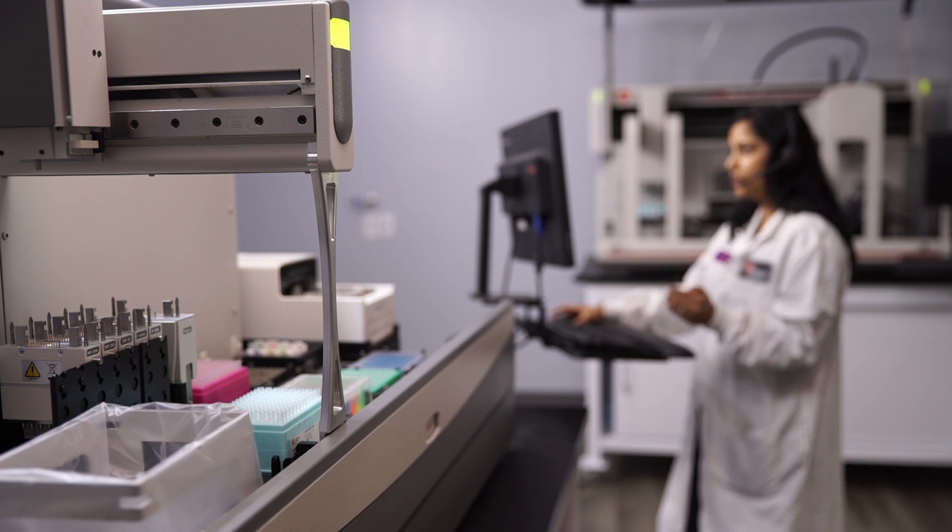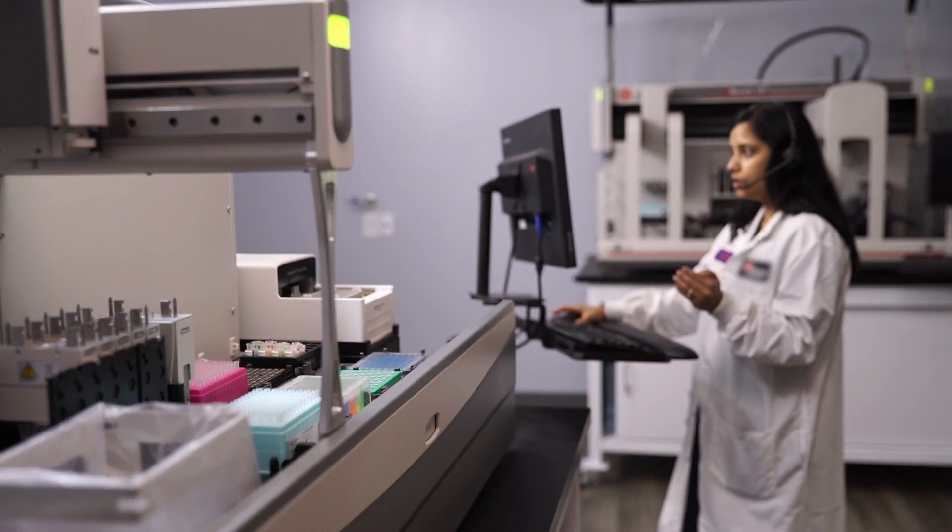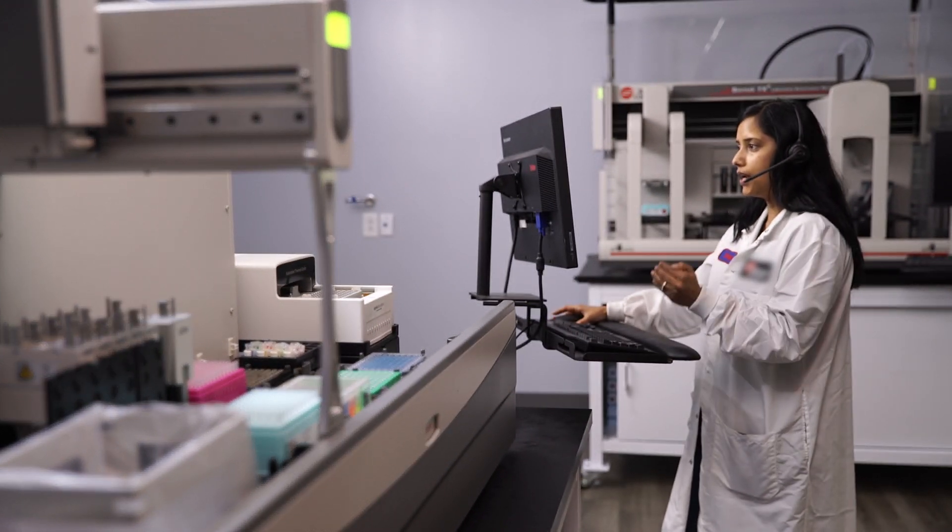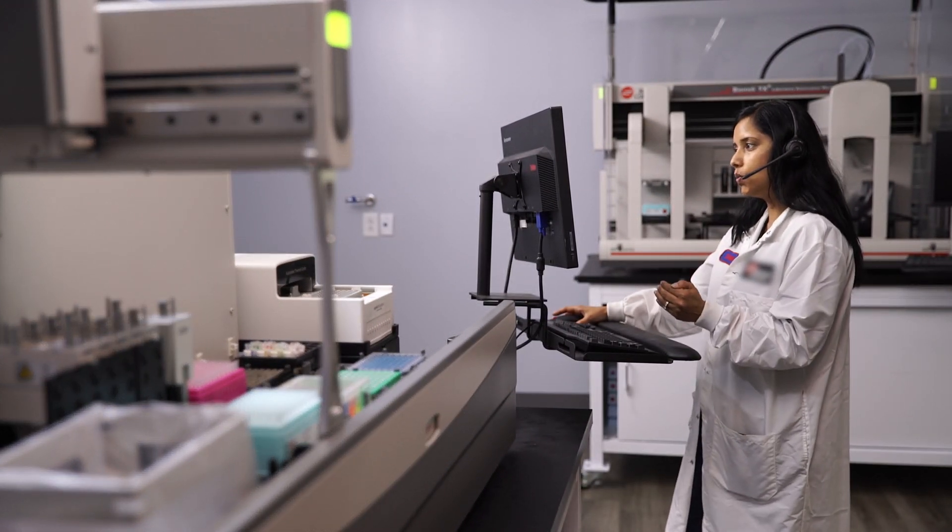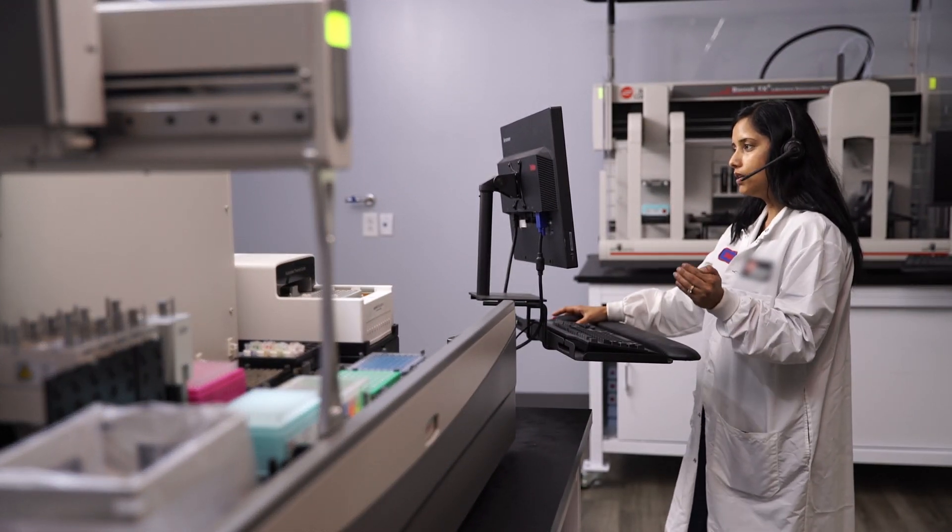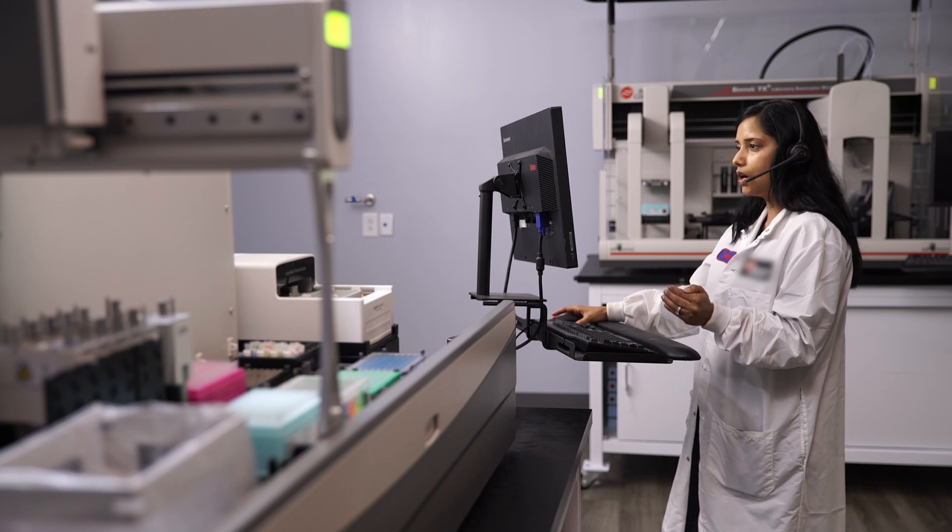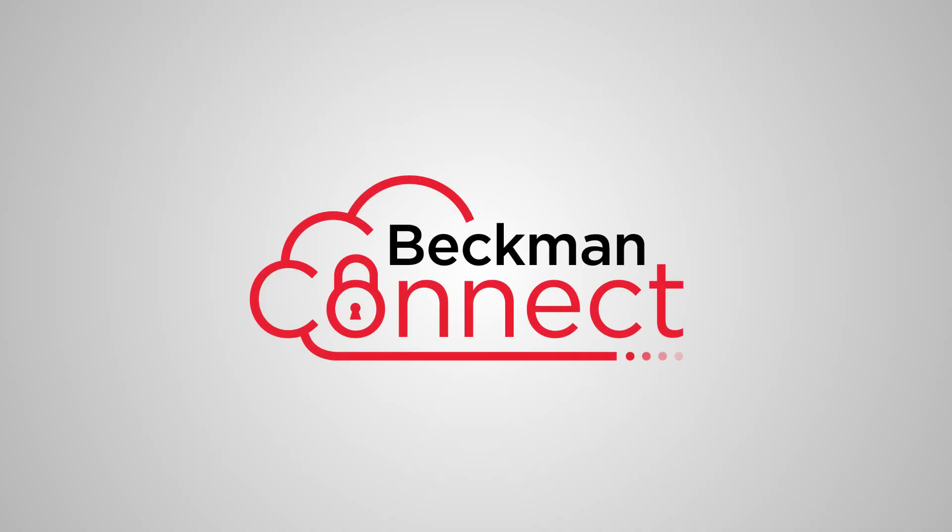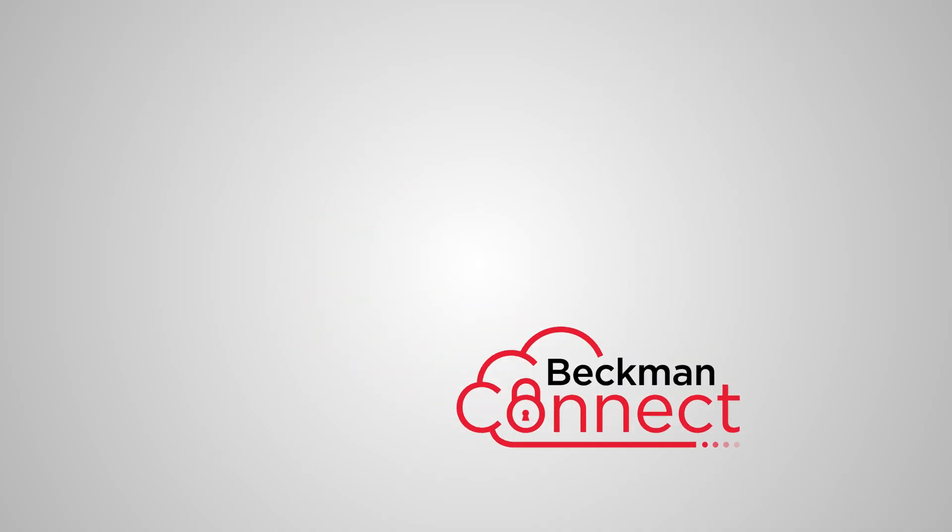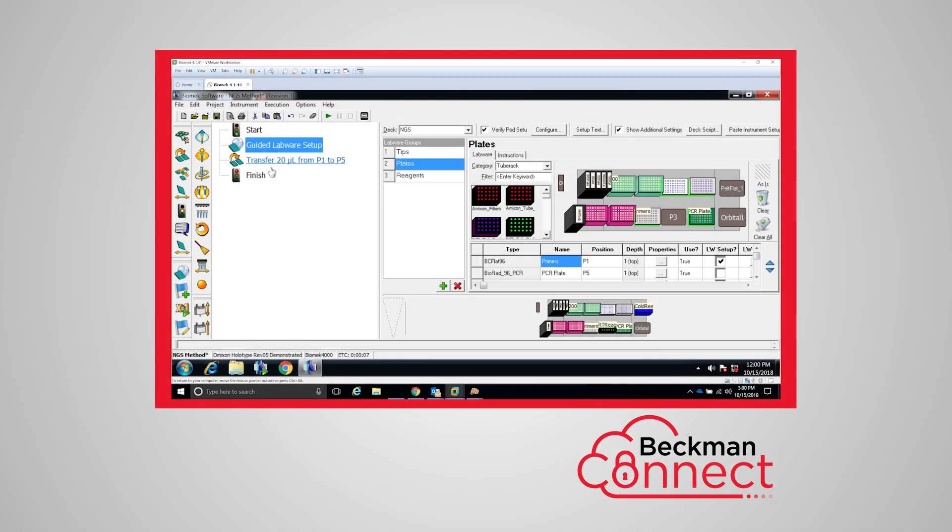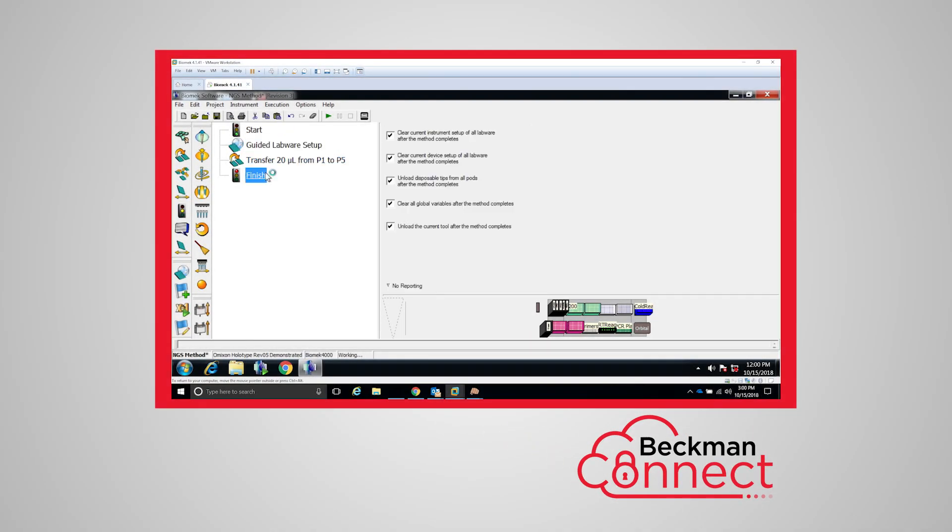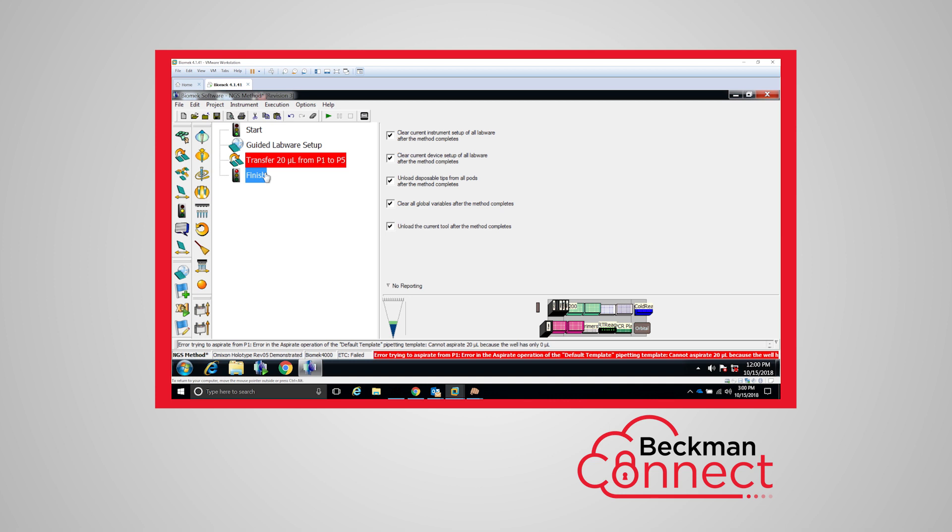And when you need an experienced and responsive service support team, we're there for you. Through our integrated connectivity platform, Beckman Connect, we can provide a secure remote connection linking you to our system of hardware and application experts who, side-by-side with you, can help you with your system.